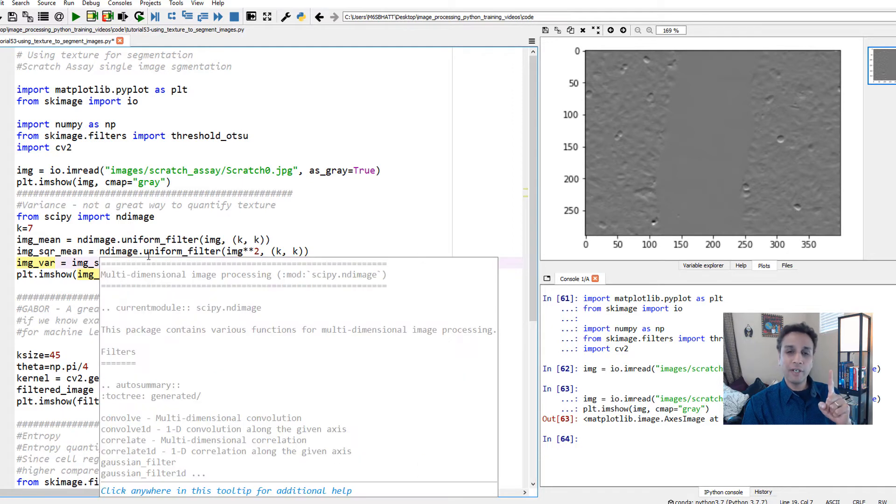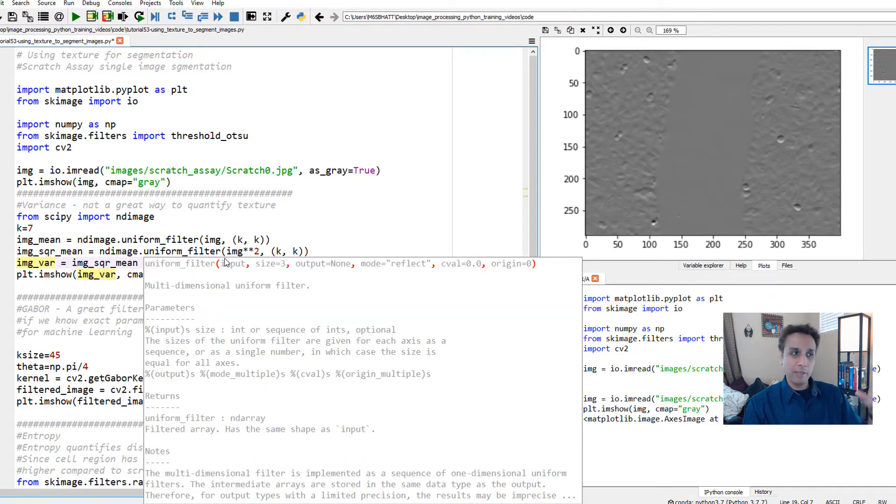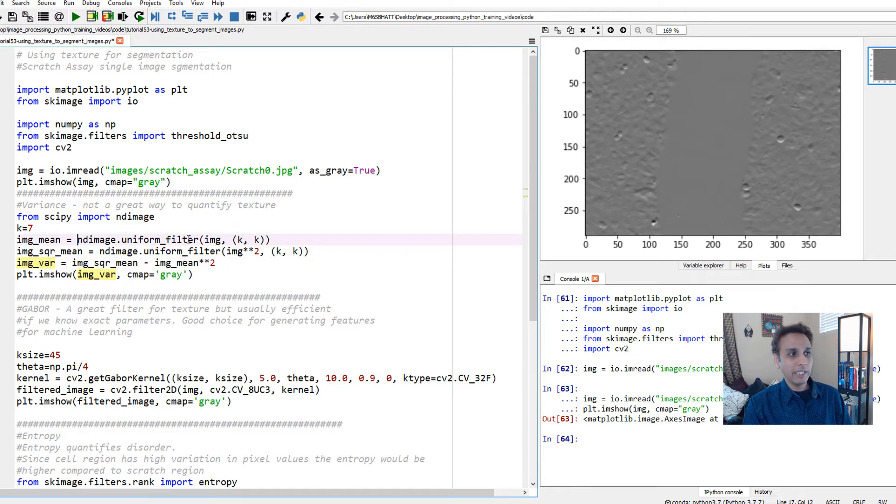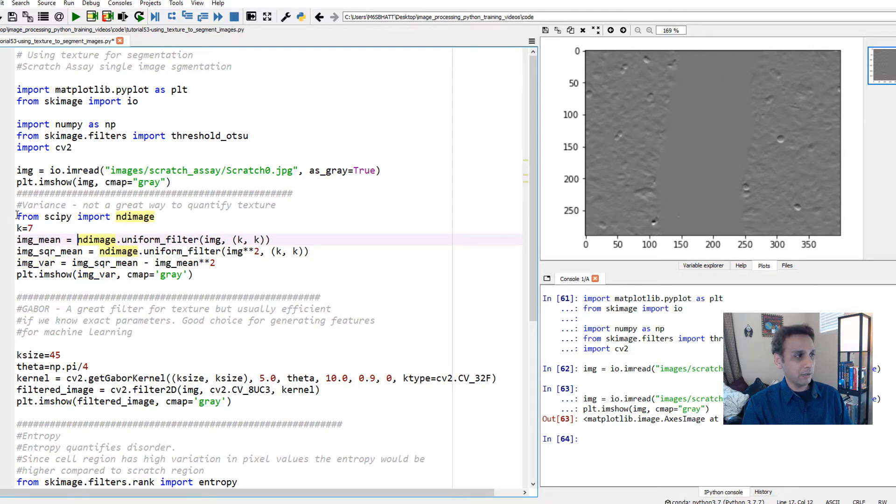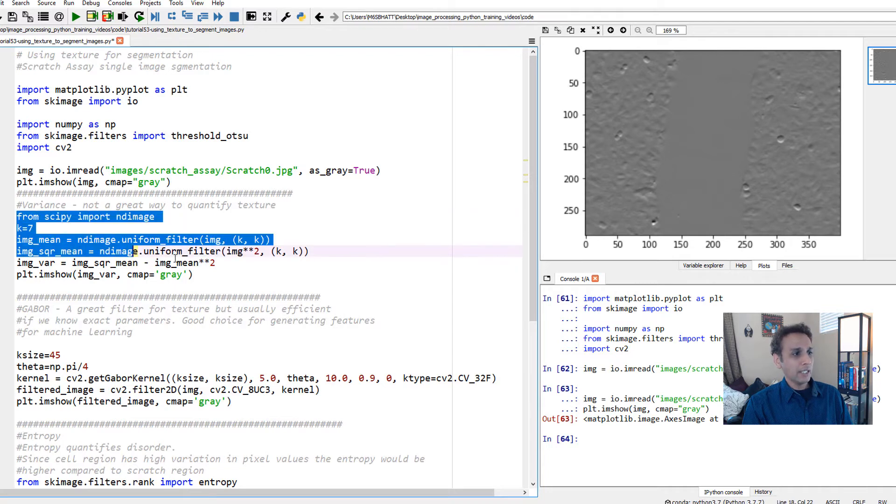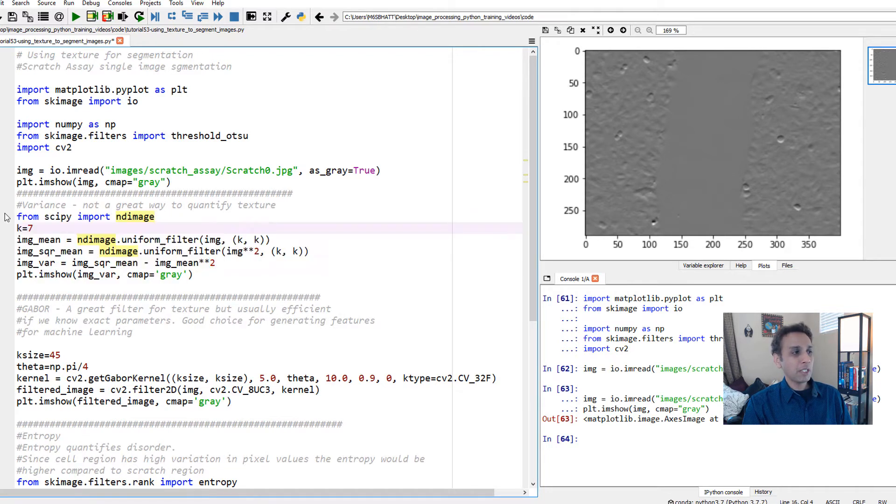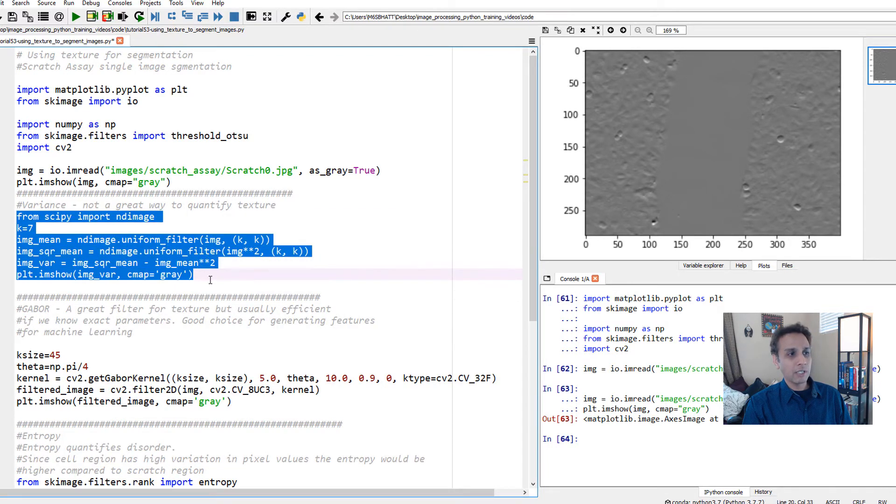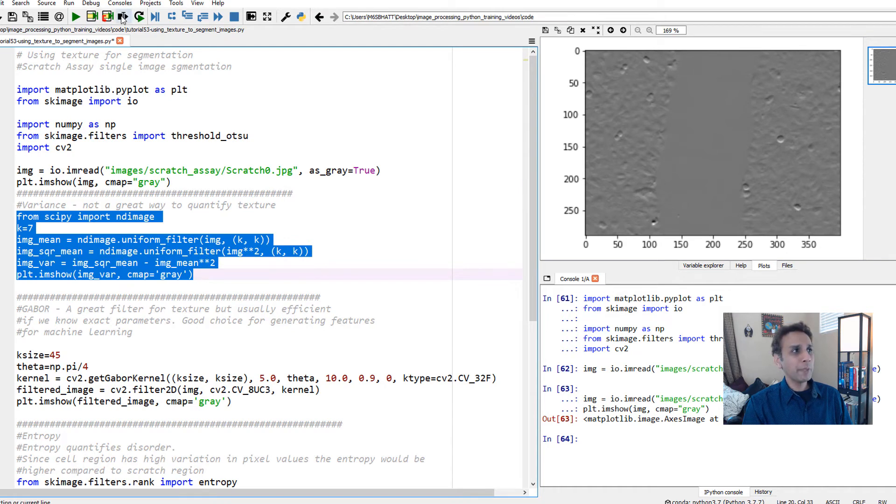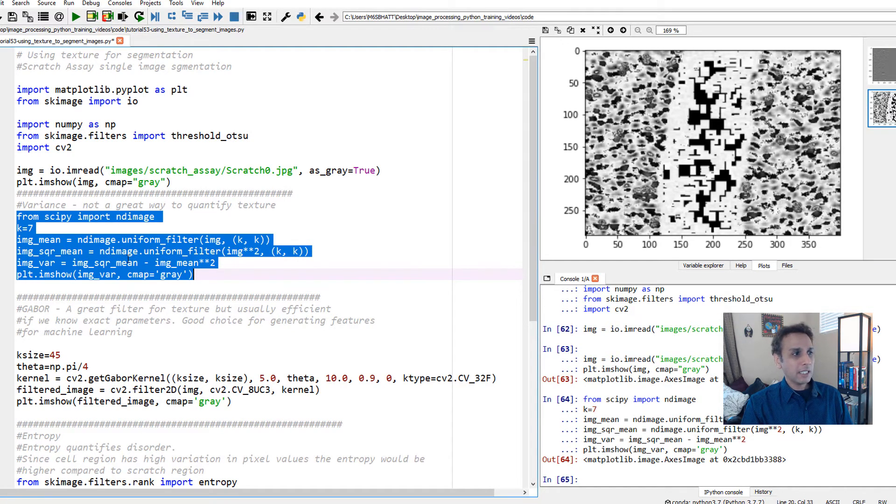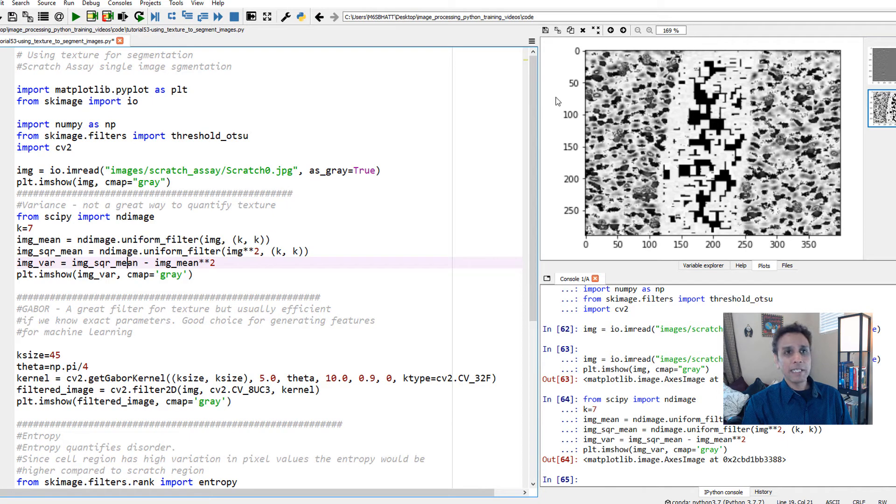Otherwise you get one single variance for the entire image. The point is running a seven by seven patch and calculating these means. Go through this code and see if it makes sense. I'm going to plot this. I'm not spending too much time because I know this is not very useful.